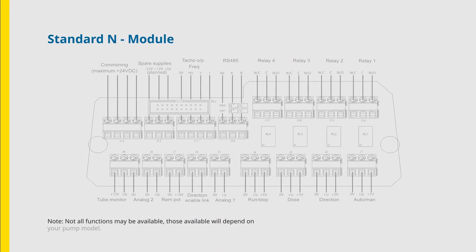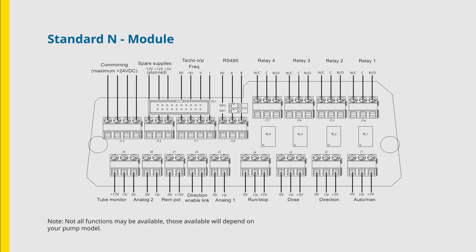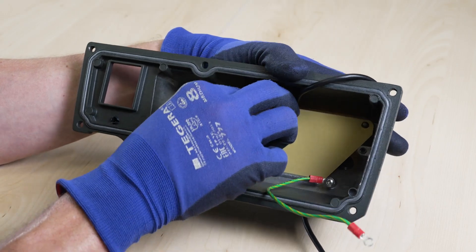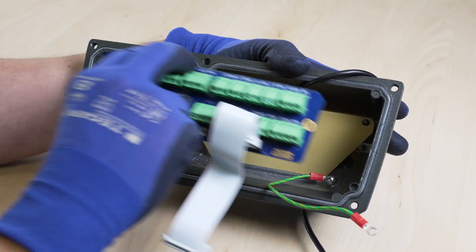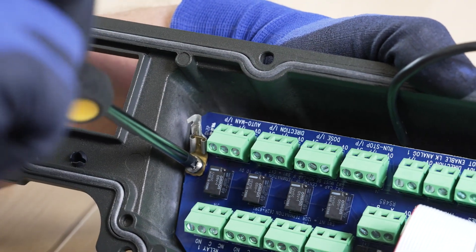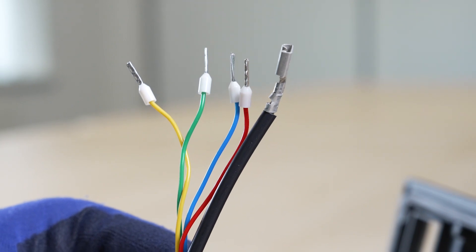These are the function options available to you on the I/O board. Replace the plastic baffle and I/O board and affix the two retaining screws.